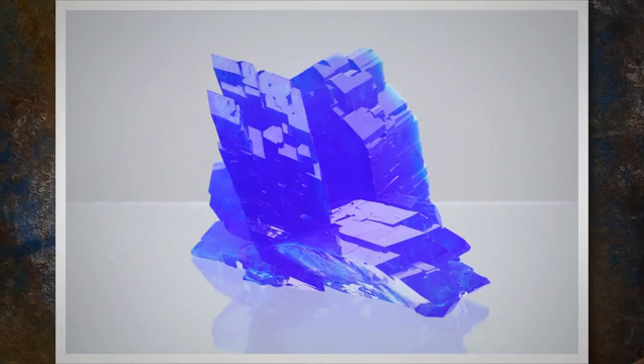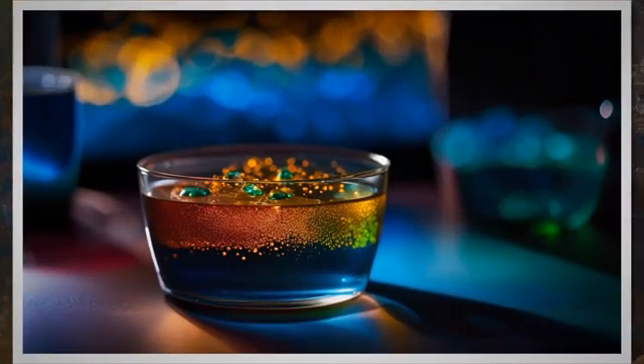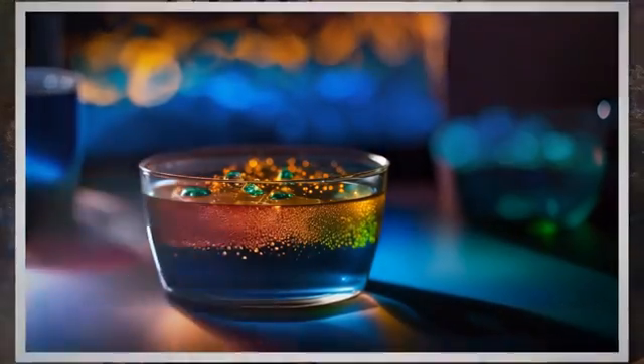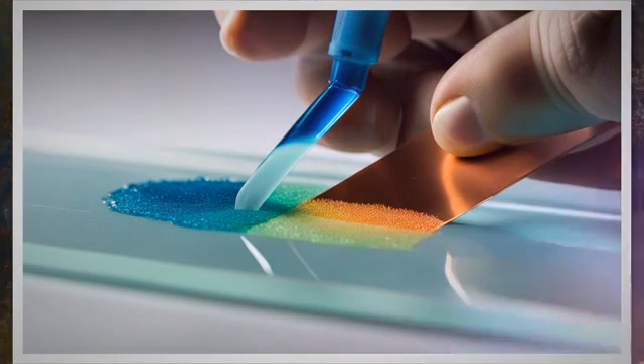The copper sulfate test procedure is used to detect the presence of free iron on a material surface. First, prepare the test solution by mixing the chemicals with water in the quantities given above and let it mix for 4 to 6 minutes. Never use a solution that was prepared more than 2 weeks prior. Apply the test solution to the surface by swabbing or brushing, and apply additional solution as needed to keep the surface wet for 6 minutes.